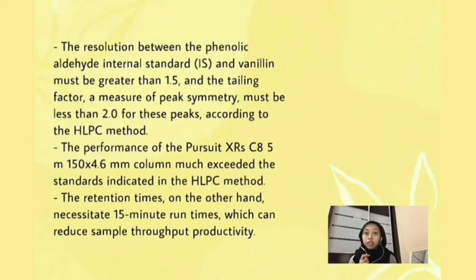The next one, the resolution between the phenolic aldehyde internal standard IS and vanillin must be greater than 1.5, and the tailing factor, a measure of peak symmetry, must be less than 2.0 for these peaks according to the HPLC method.